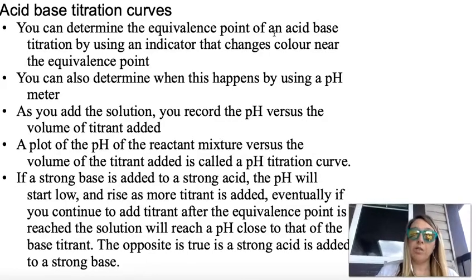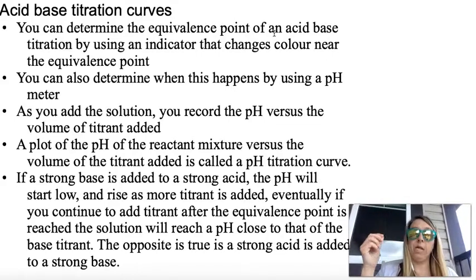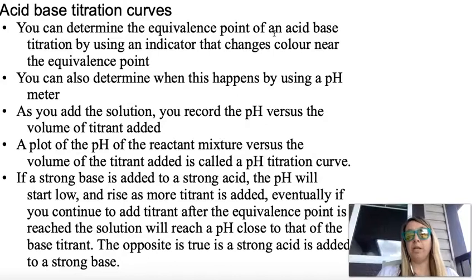I would record what its pH is when I haven't added anything. Then I would add 1 or 2 mL increments out of my burette. So I would close the valve, and then I would use my meter to stir it, and then I would check to see what's my new pH. And I would record that. Then I would add another mL or 2, and then I would stop, and then I would swirl it, and then I would record my new pH.